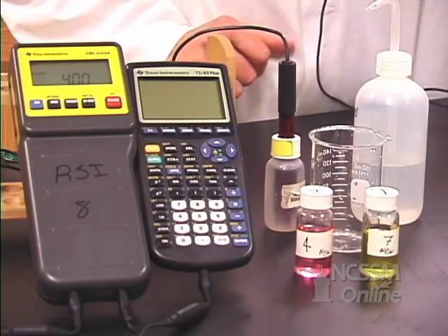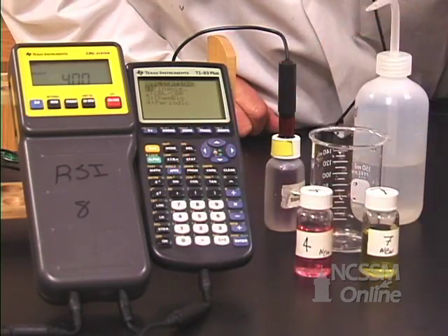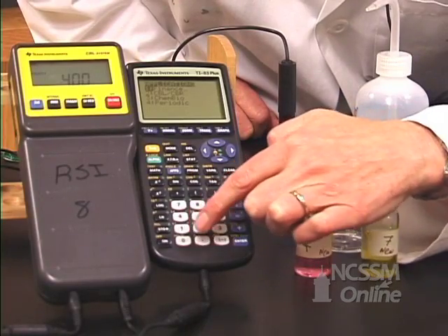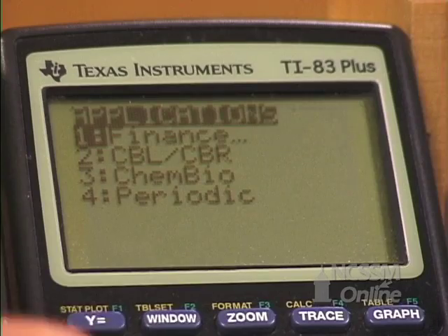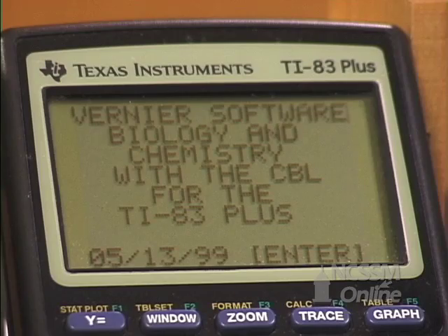Go to programs or apps wherever you've stored your program, and find a program called ChemBio. You can either press 3 and enter or arrow down. Once you see the intro screen, press enter.